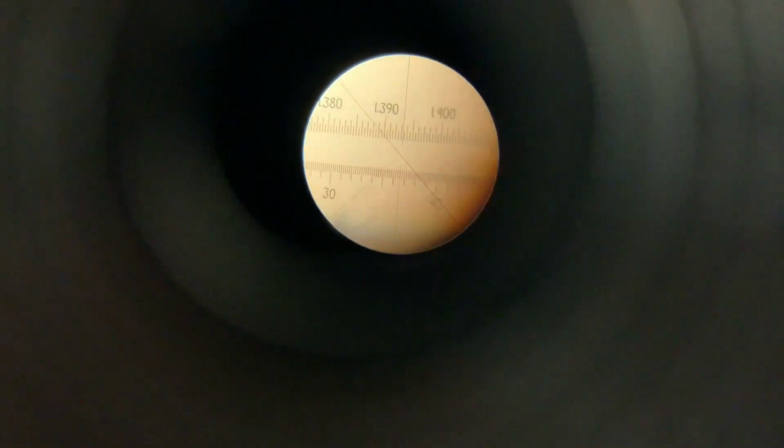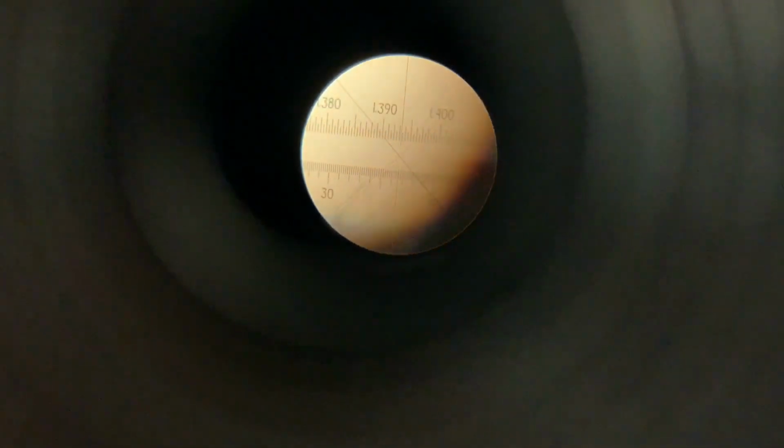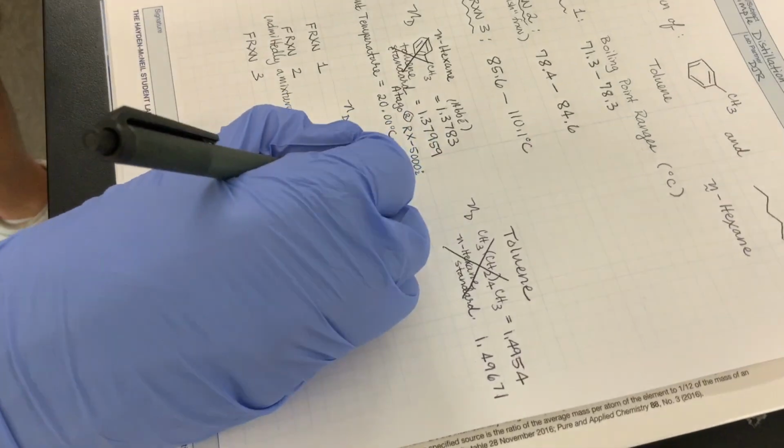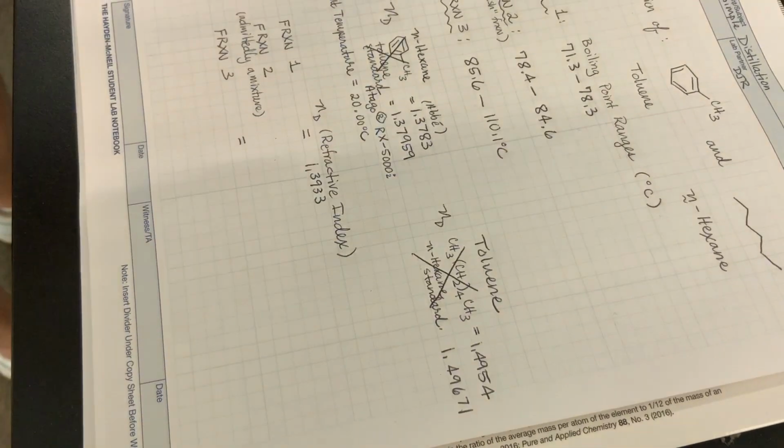So we've got it right at the half moon, and now, if we're looking at it, it's hard to, there we go, 1.39, 1, 2, 3, so 1.393, 1.3933. So that's this one, 1.3933. That's with the Abbe refractometer.